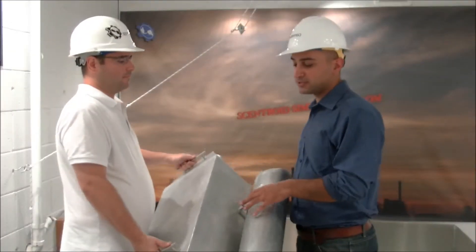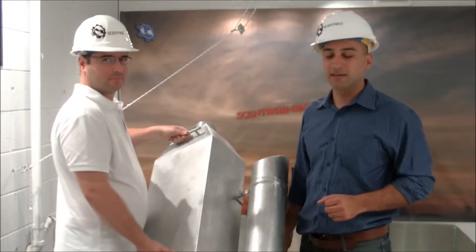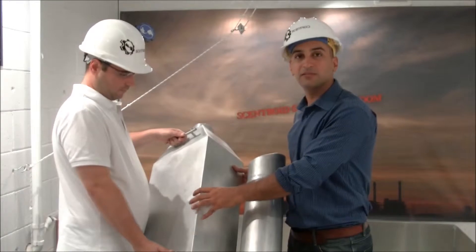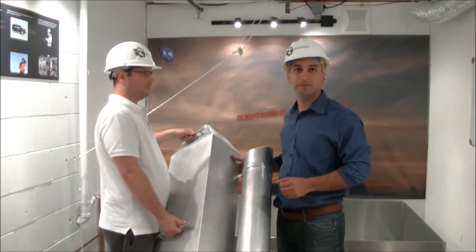One of the unique features of this wind tunnel is its weight. We use a light aluminum PTFE composite to make the wind tunnel just 10 kilograms, making it very easy to handle and deploy.